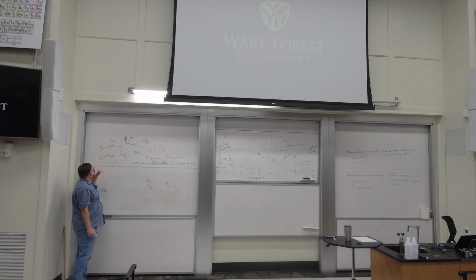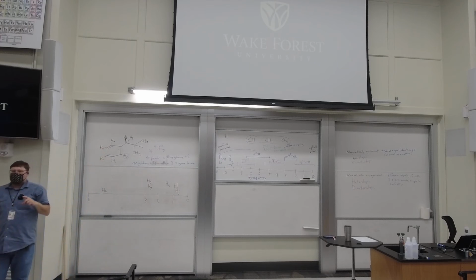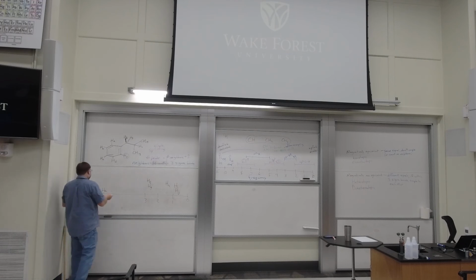And that's it. 1, 2, 3, again, a carbon. So yeah, HA has 1 neighbor. Functionally, a neighbor is either going to be a diastereotopic proton on the same carbon, or it's going to be a proton on a carbon that's bonded to the carbon that H is on. So HA has 1 neighbor.